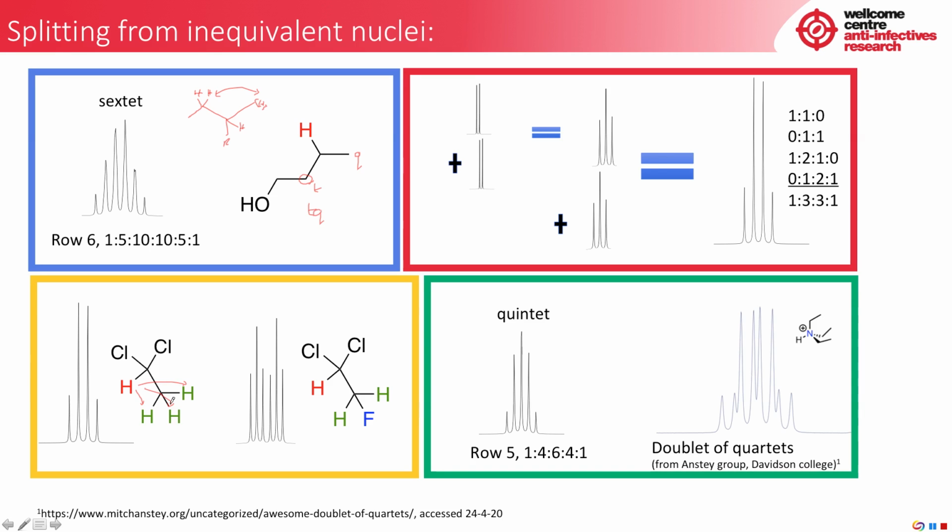And you can actually see this if you replace one of the protons with the fluorine. You're seeing coupling to the same number of spin-half nuclei, but this J value is quite different. And what results is a doublet of triplets, where here we had a quartet. So their origins are the same, the differences are in the J values. And in fact, all of these sort of composite signals, doublets of doublets, doublets of triplets, triplets of quartets, whatever, are constructed in this fashion.